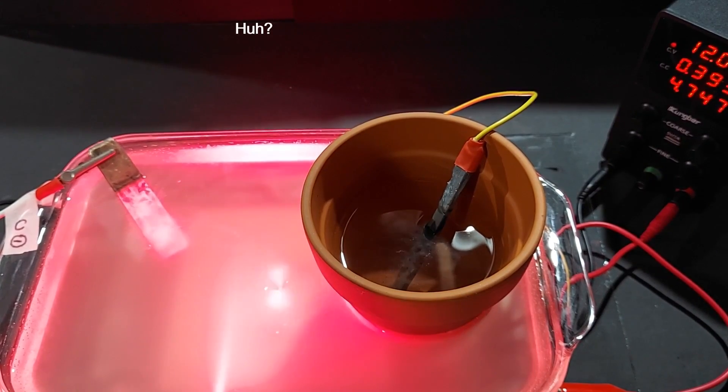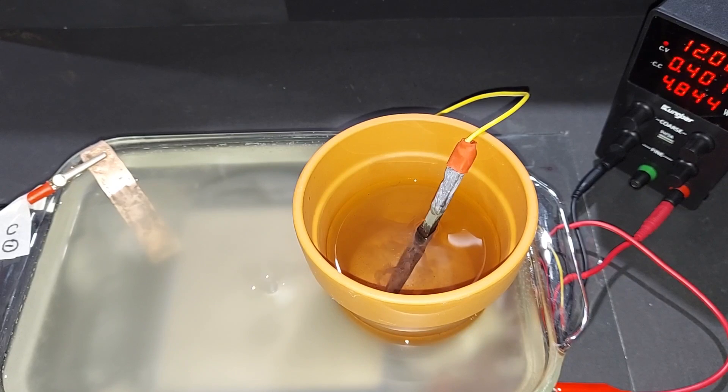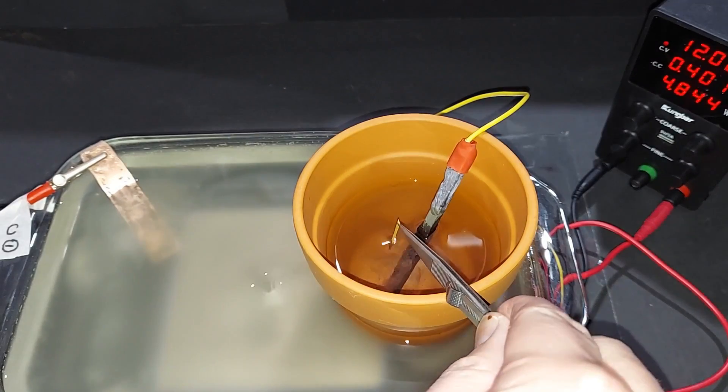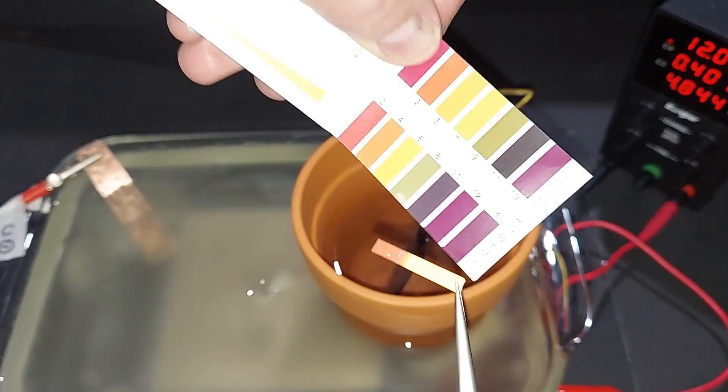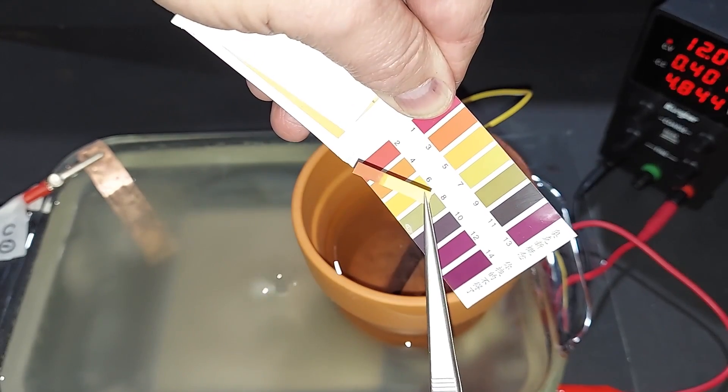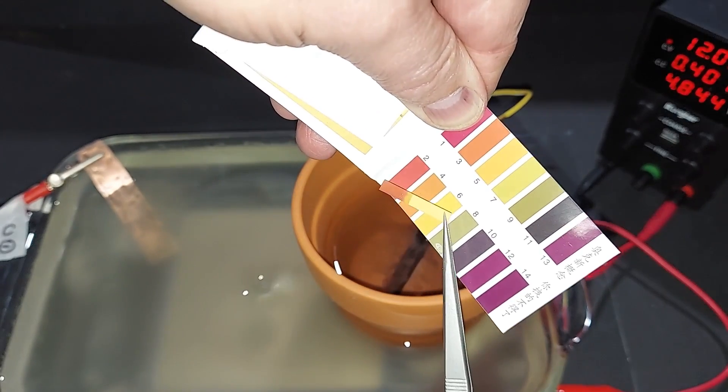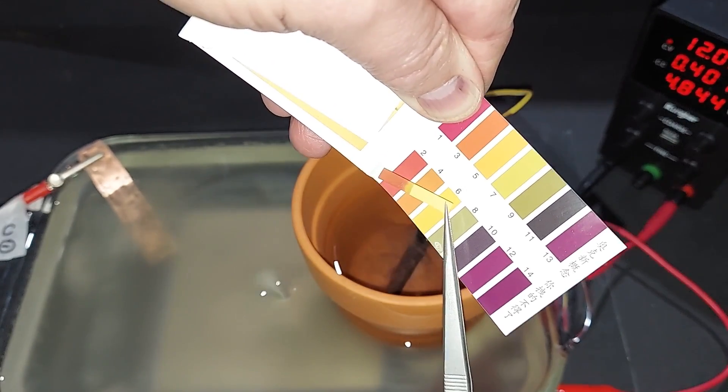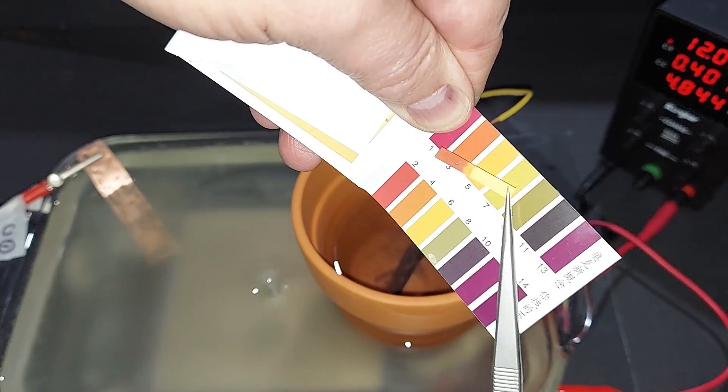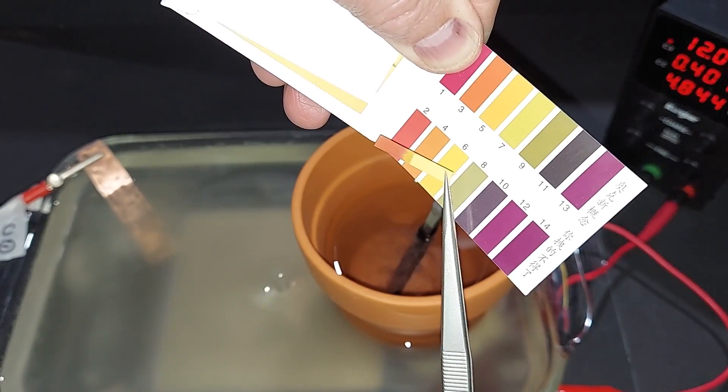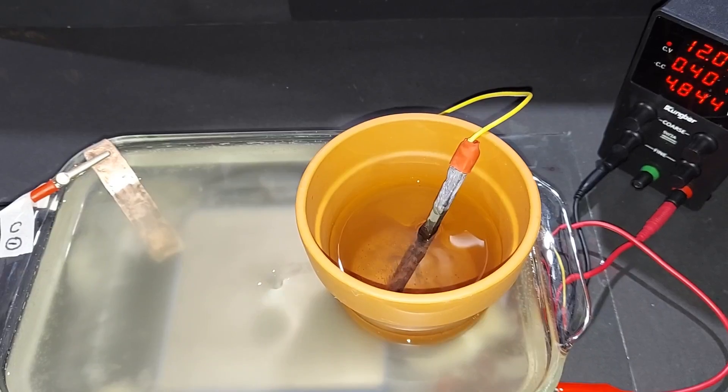Four hours out, we're at 0.4 amps. Still getting a lot of bubbling. Checking the pH—that's really close to a 2, darker than a 3. We continue to lower the pH, which is a great sign.